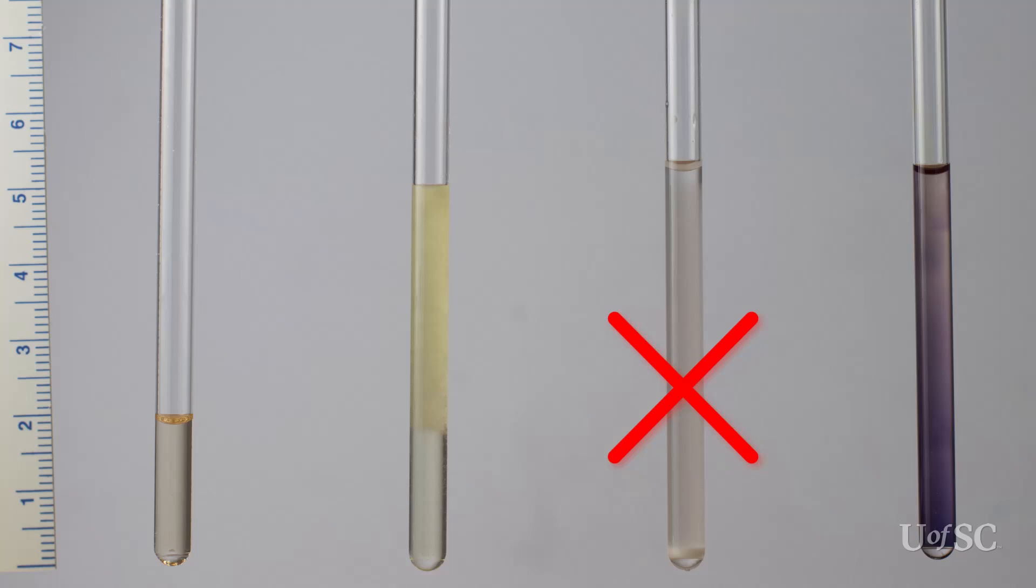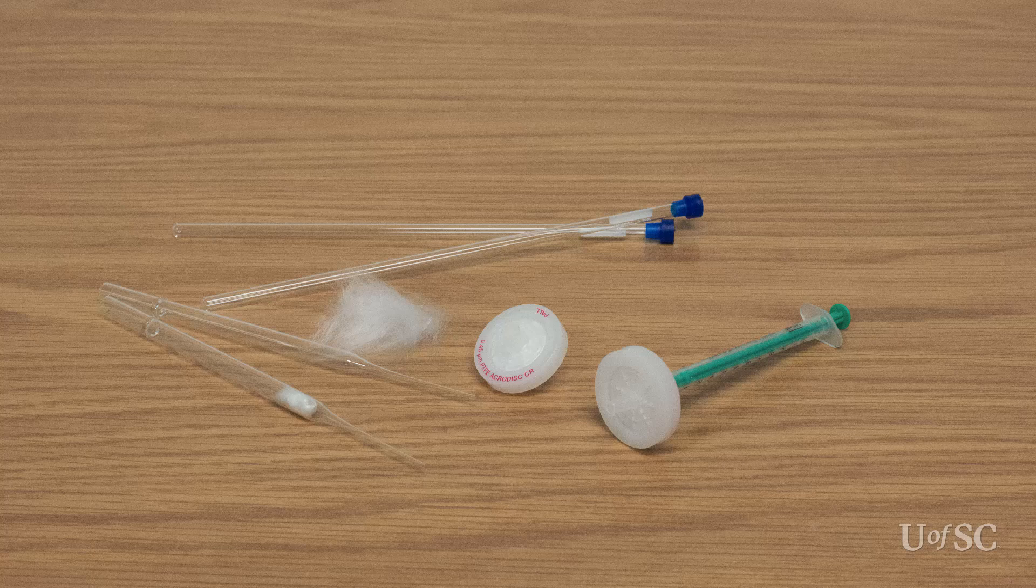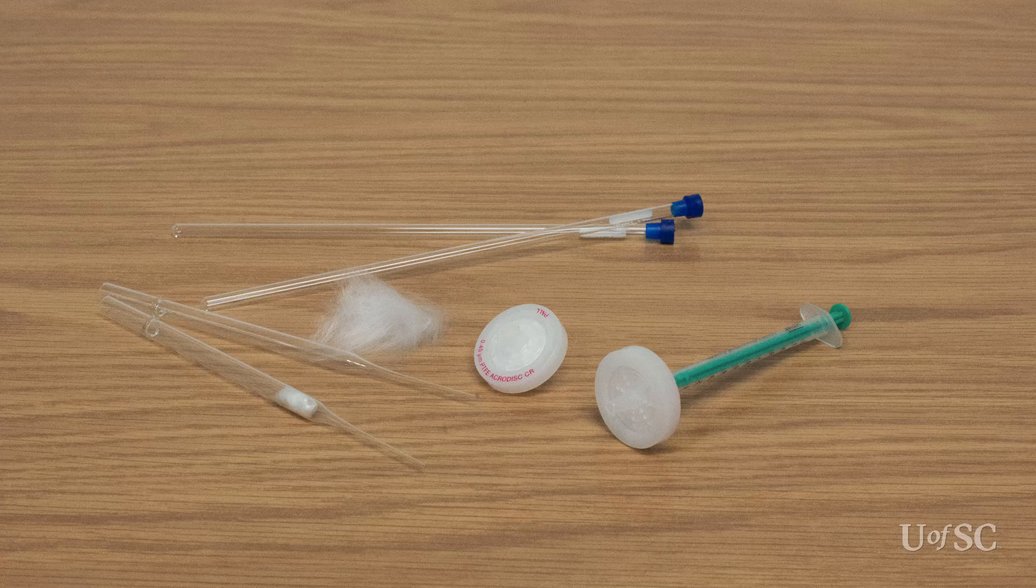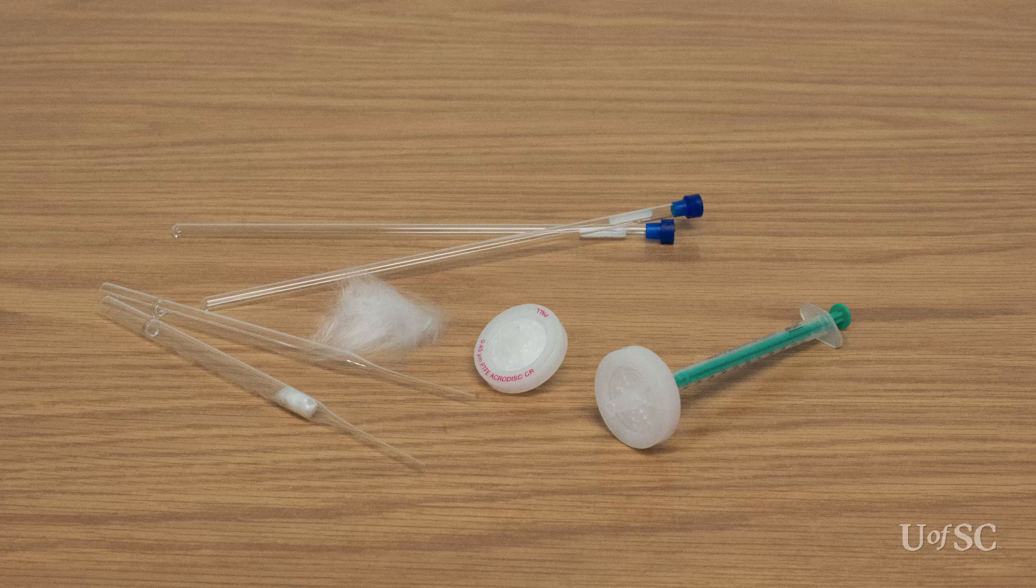Samples like these should be filtered, decanted or centrifuged to yield clear solutions. A pipette filled with glass wool is an effective filter for NMR samples. Syringe filters are also very good, but you could lose a significant volume of sample in the filter itself.